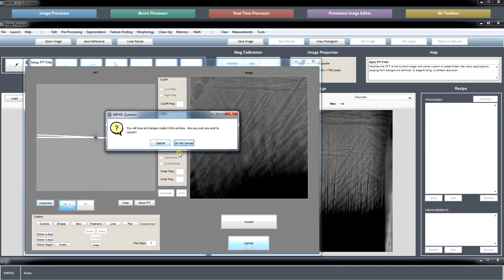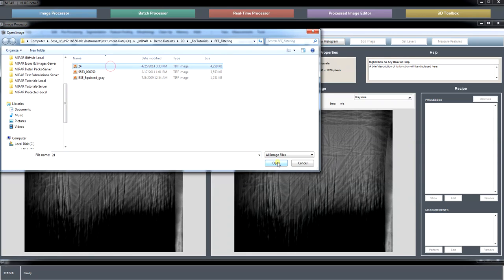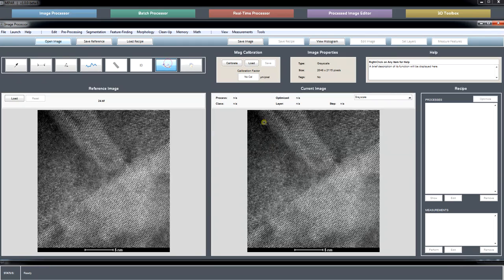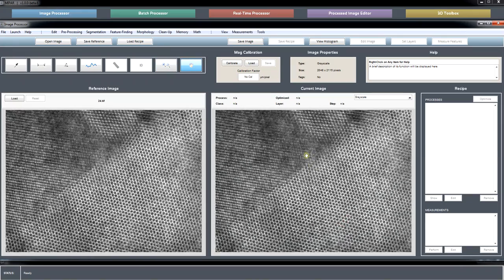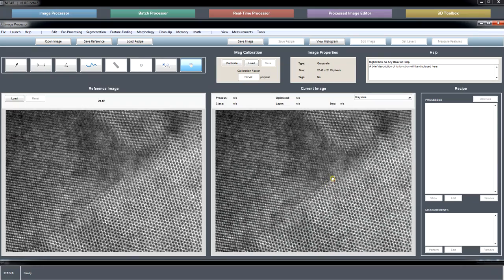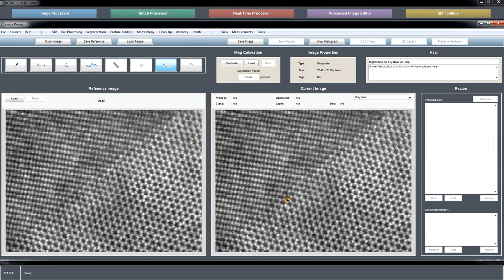Okay, so there's a second application, and the last one will be some spot filtering here on a high resolution atomic lattice image, where you have to be careful with this filter and definitely disclose in any publication that you include the results of it that this is what you've done, because there are certain cases where you don't really want to be doing this. But for some applications, it can definitely be helpful to bring out some atomic lattice that was otherwise unclear.